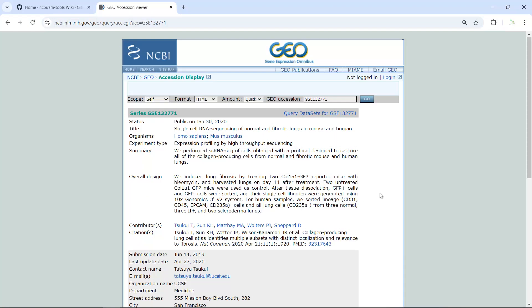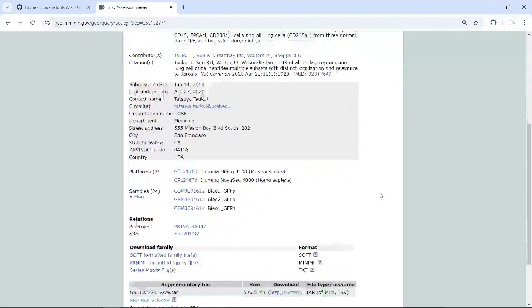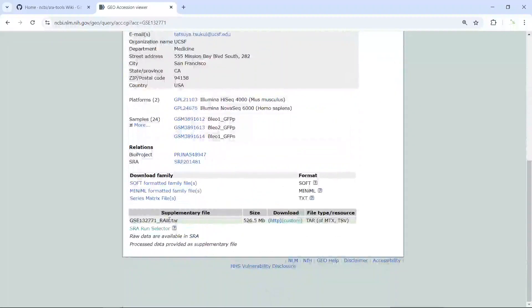In my first video tutorial, I showed you how to download the gene expression data for this dataset. But sometimes we need the raw data. For example, if you want to perform RNA velocity analysis, you need the raw data to create the spliced and unspliced mRNA BAM files.